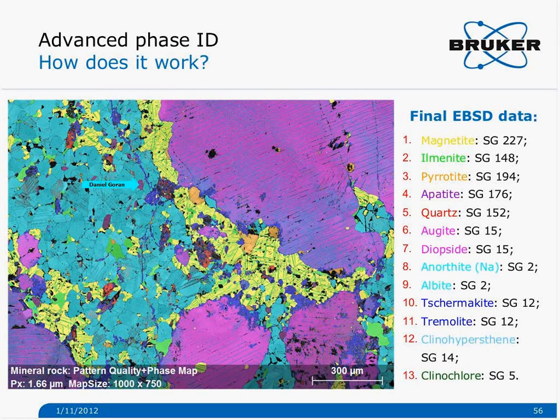It's very difficult to prepare the sample, and so you have to work with poor patterns mixed with very nice ones. So of course, in this case, you can save them. Maybe you will need them, but usually the detected bands are enough.